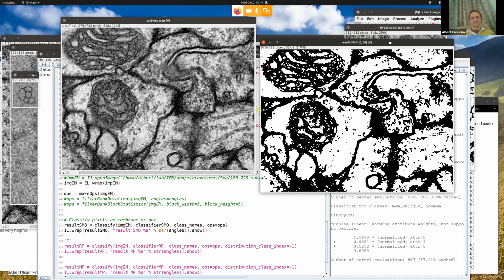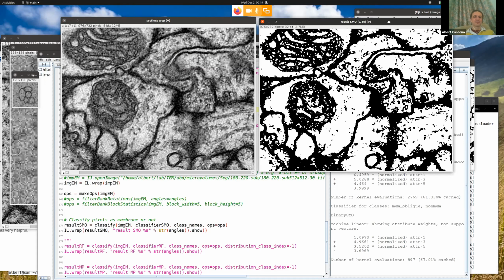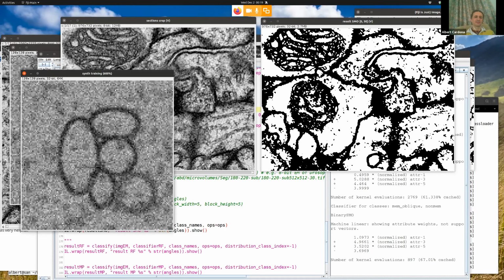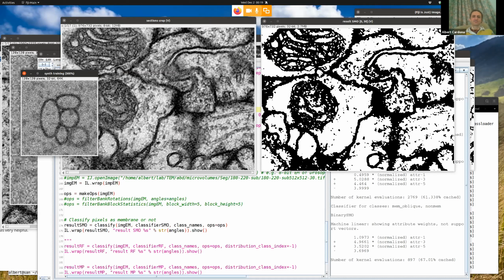Again, the training should be done separately. We should load this stuff. But bottom line, that's one way in which we can get a segmentation for this. And actually, segmentation is pretty good. I mean, I'm kind of shocked at the unreasonable power of machine learning. I mean, I made up the training data. Can you believe this? It's all in this script.